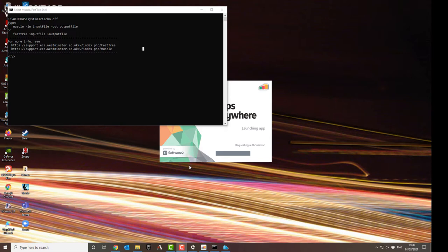At the top, it also gives you the basic instructions on using Muscle and FastTree. To use Muscle, you type muscle -in input file -out output file. And to use FastTree, you type FastTree input file greater than symbol output file. These are the simplest ways to use the program. We're going to use more complex commands with additional command line arguments.